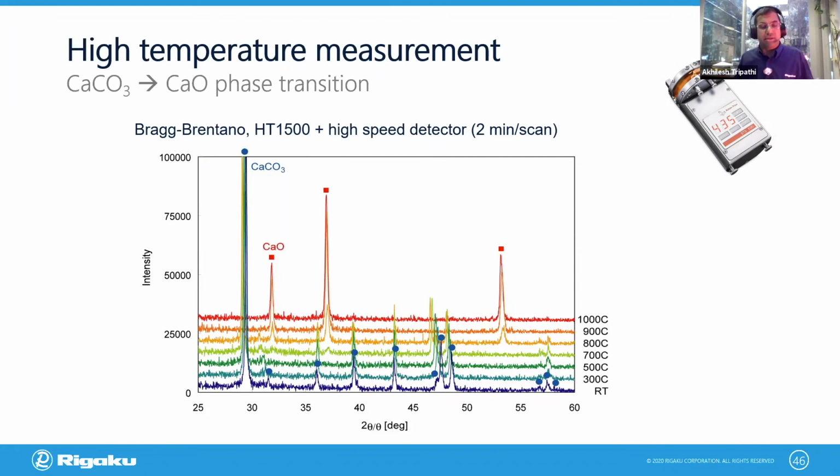So in these in situ measurements, there is a third dimension of 2 theta intensity and time and temperature. You can heat the material and collect the data at desired temperatures where you believe either the unit cell is transforming or the space group is changing, which is why they mentioned orthorhombic to tetragonal to cubic forms, and these phase changes are easily visible, and you can notice the behavior of the material at specific temperatures.